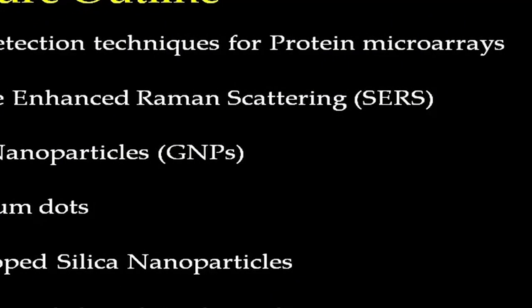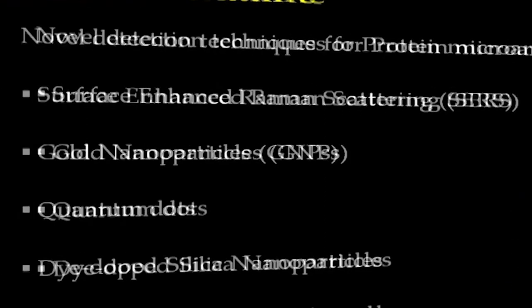Welcome to the MOOC course on Interactomics. In last lectures, we have discussed various conventional detection methods employed for protein microarrays. In today's lecture, we will discuss various advanced detection methods. We will also talk about a few methods in more detail, such as SERS based nanoparticles, quantum dots, dye-doped nanoparticles and biobarcodes.